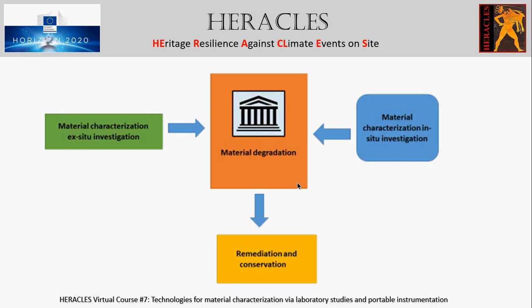It should be versatile, allowing with the same technique average compositional information to be obtained, but also local information of small areas from heterogeneous materials. And it should be sensitive, so that object grouping and other types of provenance analysis can be done not only by means of major elements, but also by means of trace elements and fingerprinting.